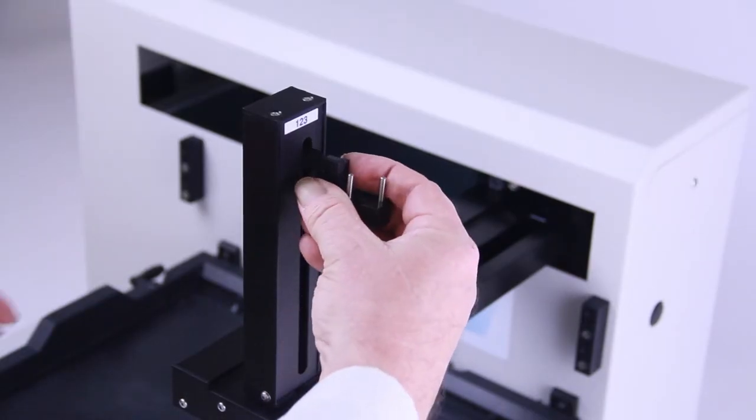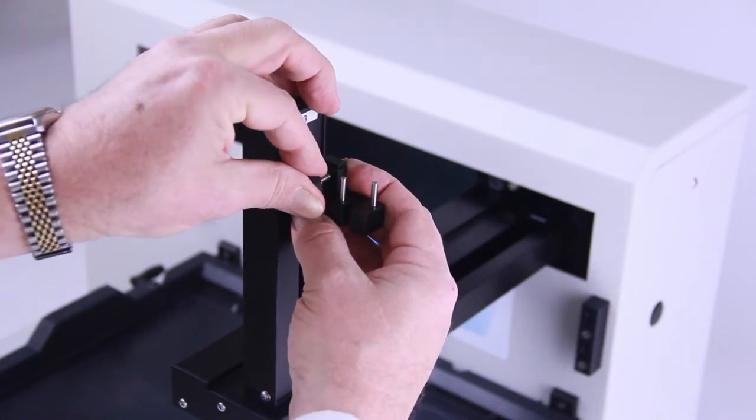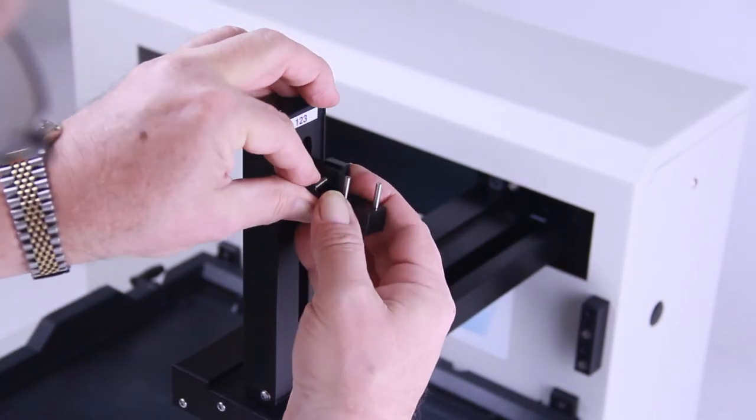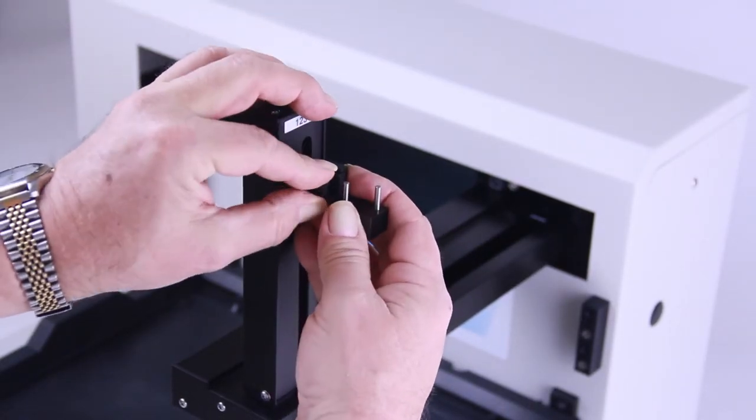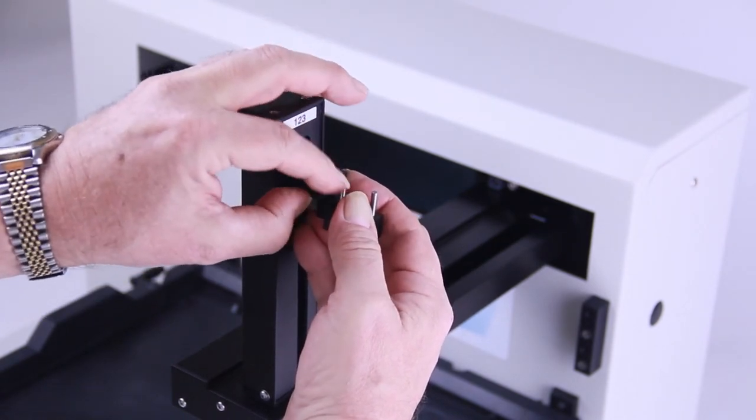To install the electrode holder, slide it into place on the electrode holder bracket and secure it with the supplied thumb screw.